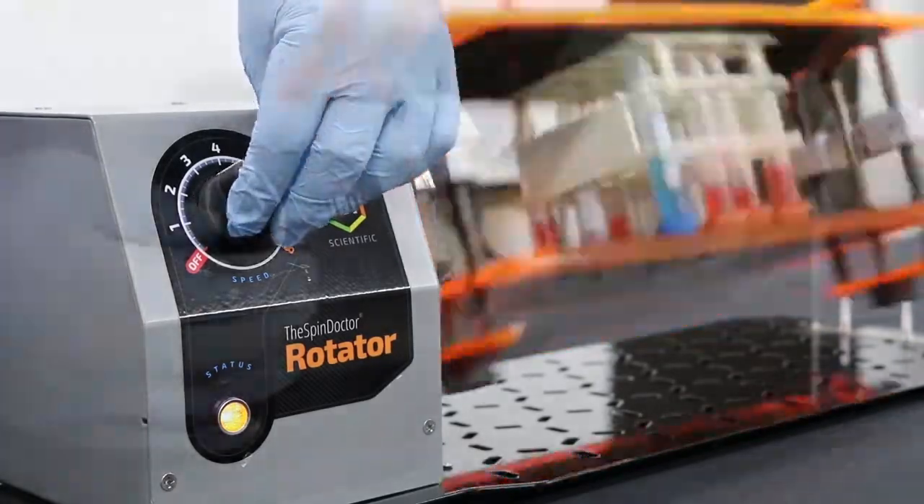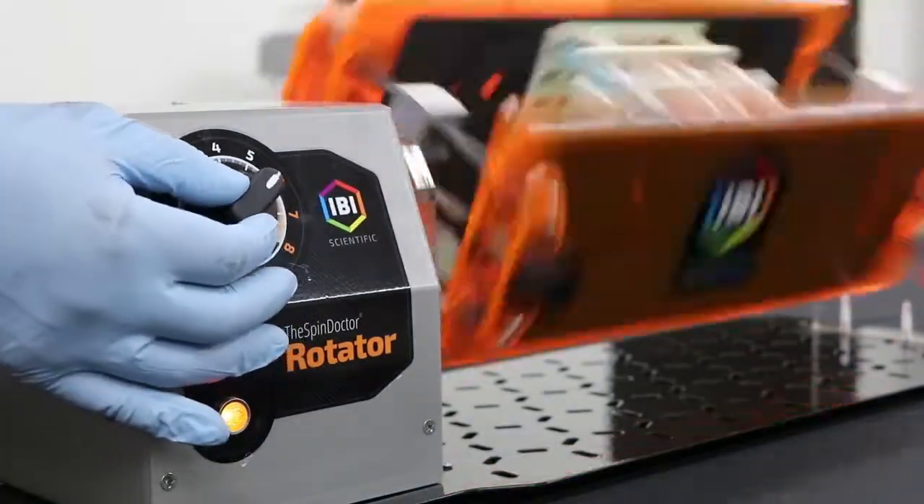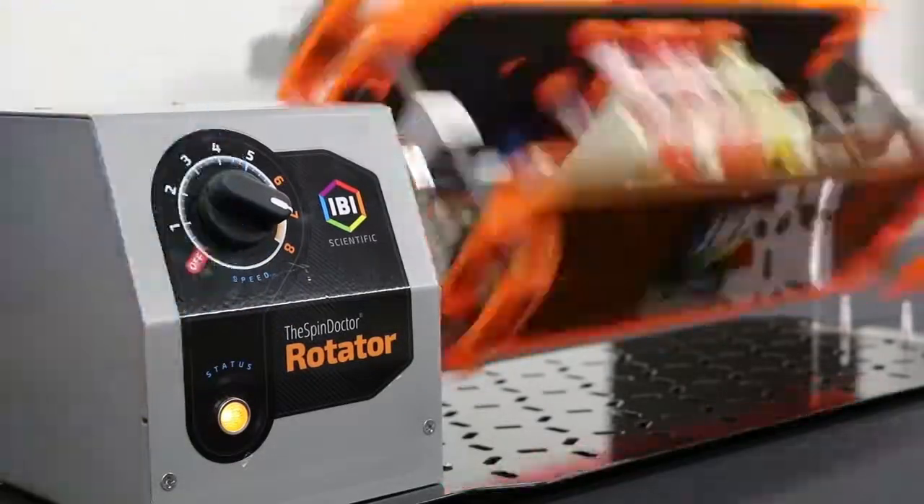With the wide range operational speed, you can spin anywhere from 3 RPM up to 100 RPM.